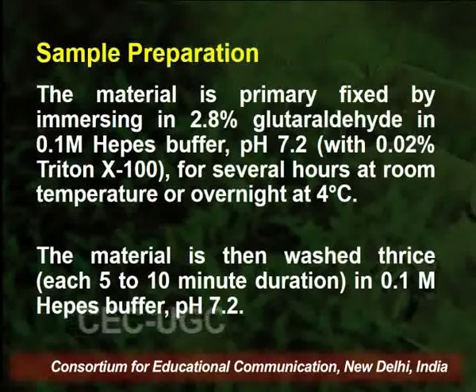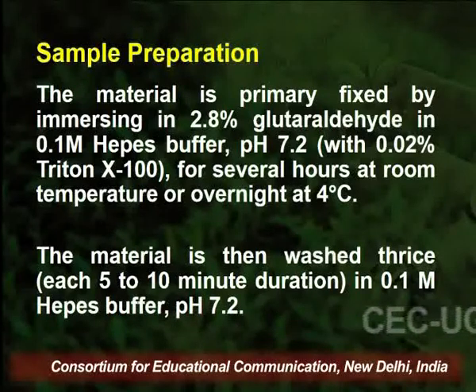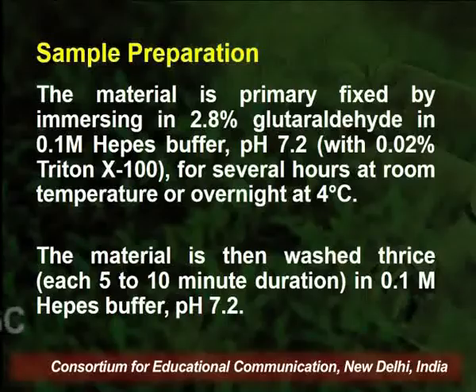This treatment of any material with glutaraldehyde fixes and binds all the proteins at their own position, so that while further preparing the sample, these proteins and other components do not move their places.